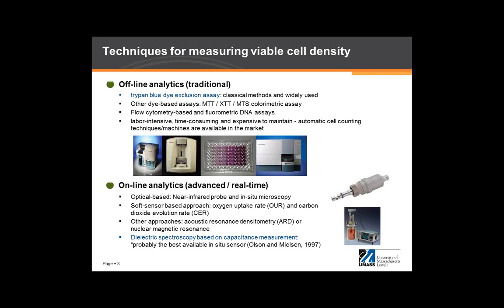And in the last several years, including Aber's new technology that we're going to be covering today, a few alternatives came out. About 2 decades ago, near-infrared spectroscopy came on as the first technology.